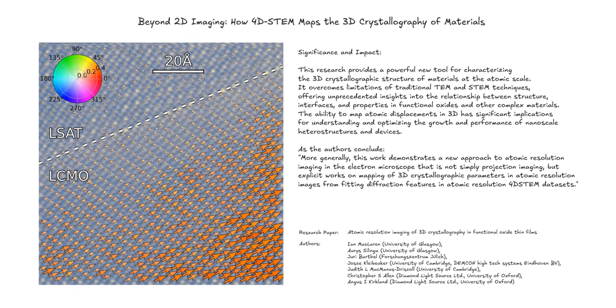One of the main challenges is the need for highly specialized equipment and expertise. 4D STEM systems are complex and require skilled operators to acquire and analyze the data, which limits the accessibility of the technique to a relatively small number of research groups.